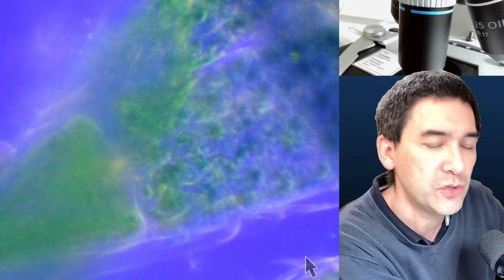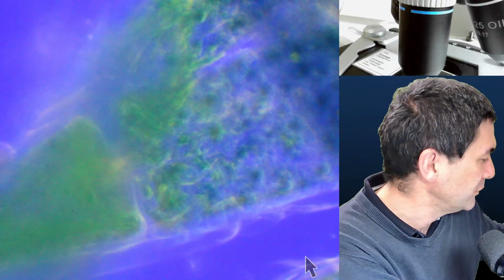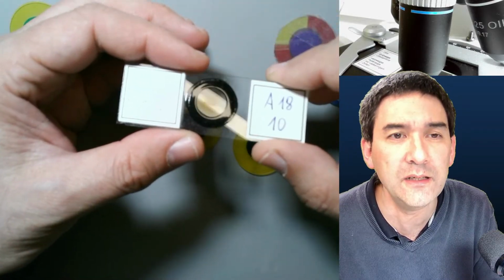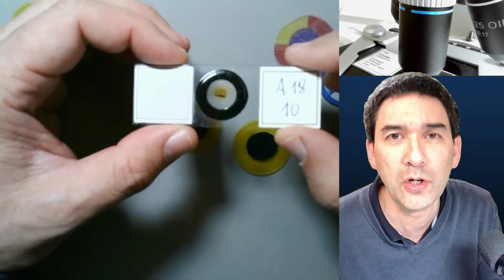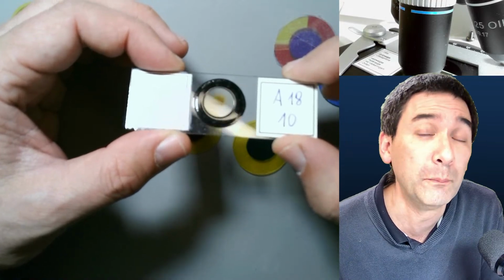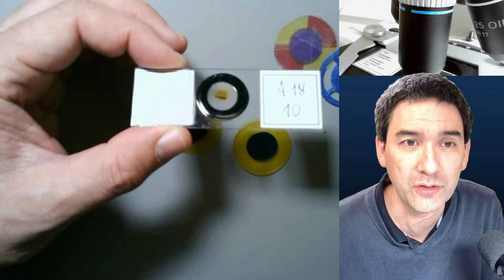And I say that I'm not even sure anymore if this is glycerin jelly, because usually if you have a slide with glycerol gelatin, then the slide is ringed. I'm going to show you what a ringed slide looks like. This is a ringed slide, and if you use glycerin gelatin, you have to put a ring around it to protect it from either drying out completely or absorbing moisture, right?